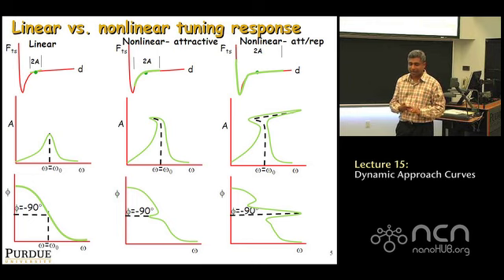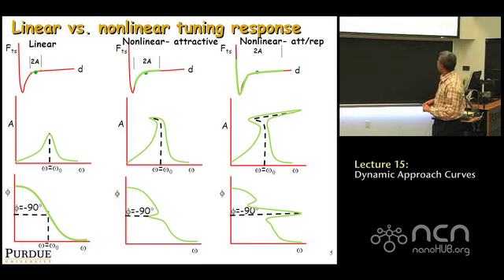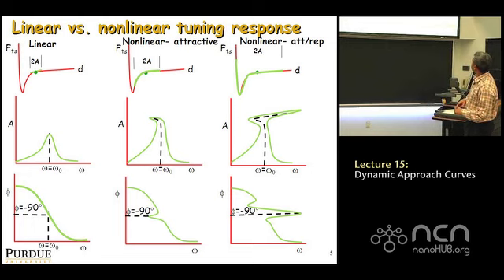How are they different? And do they switch during an image? If they start switching during an image, then you have a problem, right? So it turns out that what happens is, if you look at the column on the far right, if you're on the very top plateau, right, you are in what's called a net repulsive regime of oscillation.